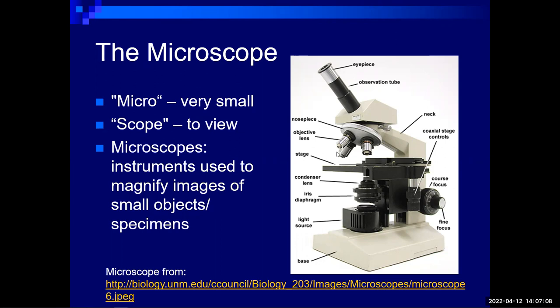And I could tell you, in terms of prior knowledge, do take note of these parts of the microscope. It's virtually a routine question that comes in terms of labeling this when you do have your spotter. All right, when you do have the assessment, it is routine. So just take note of these different parts of the microscope itself.